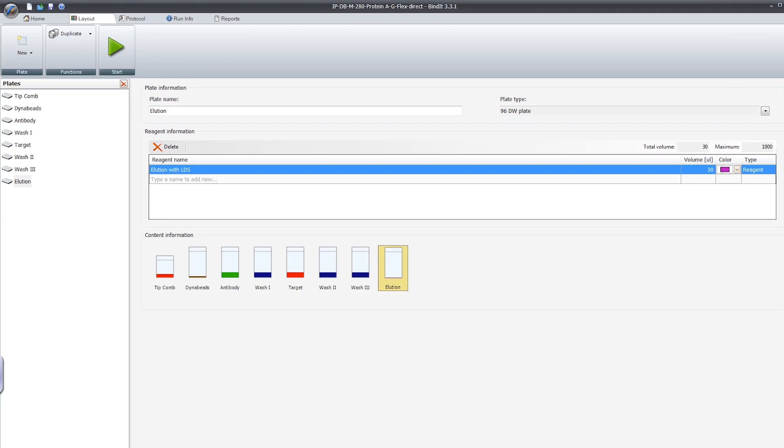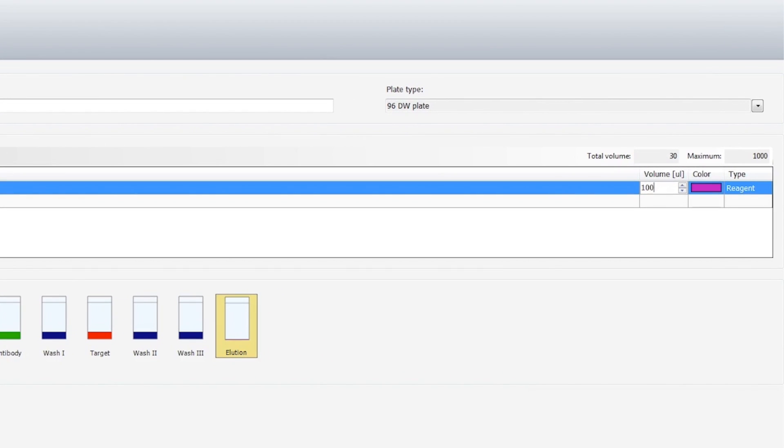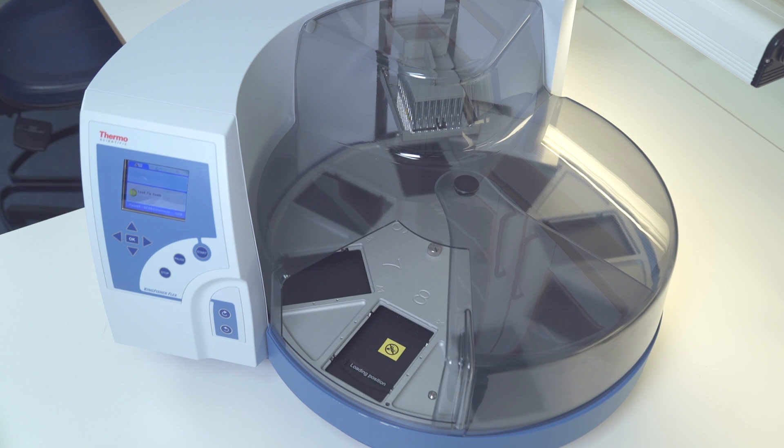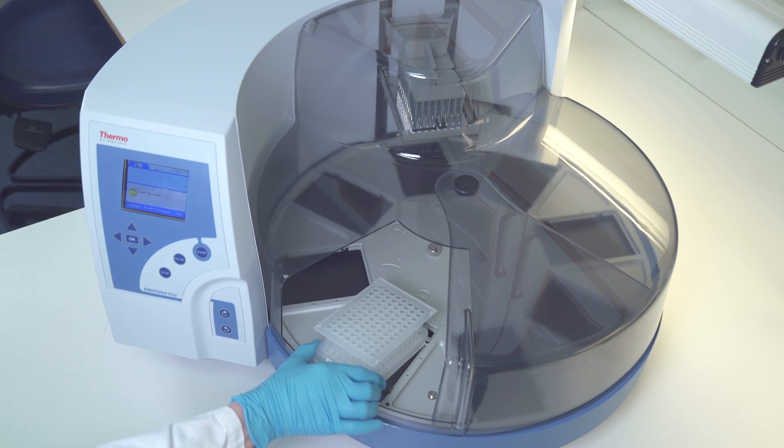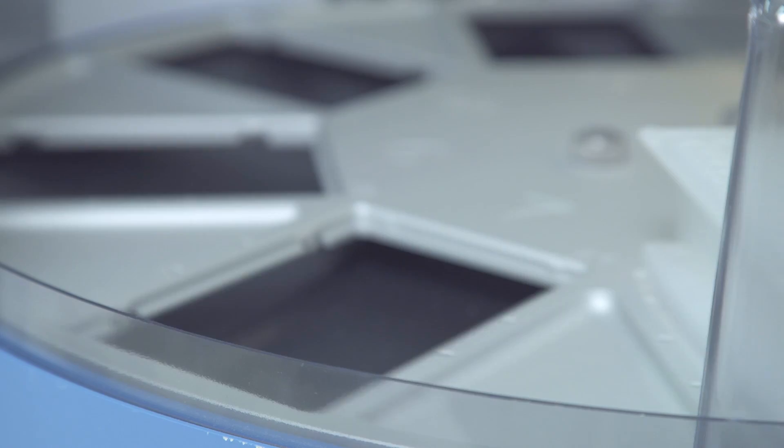You can use the standard 40-minute protocol as is, or easily modify it and save your own custom versions with the user-friendly BIND-IT software. Loading the plates is easy and KingFisher will tell you which plate to load into each position. Load the tip combs and the seven plates in sequence.